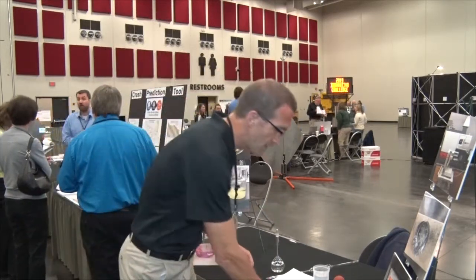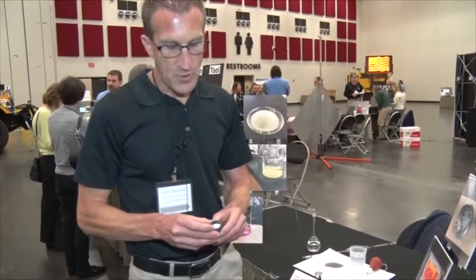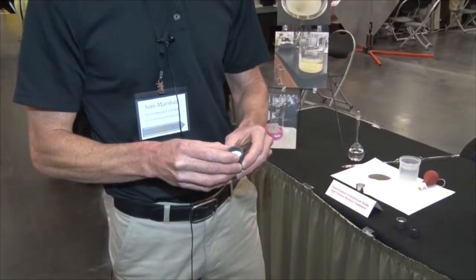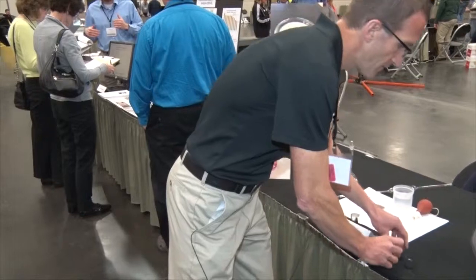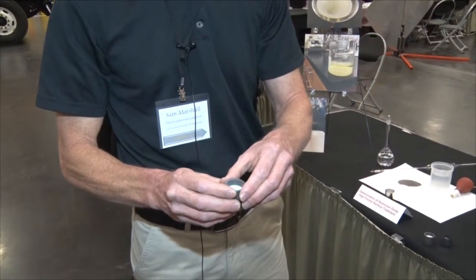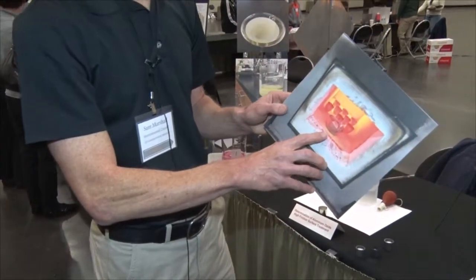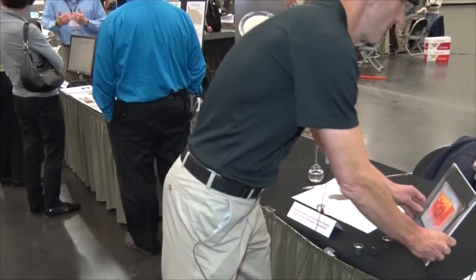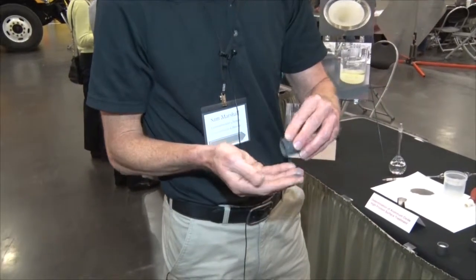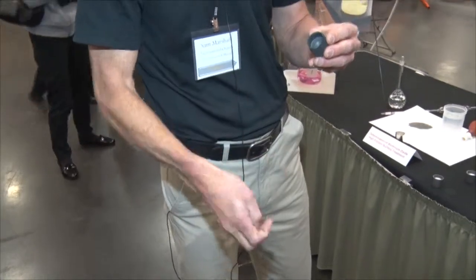One thing I do is you take a known weight of the sample and you put it in what's called lithium metaborate, which is a fusing agent. What that'll do is encapsulate the sample, and then I'll fuse the sample in a 1,000 degrees C muffle furnace. It'll fuse, and it'll become a fused bead like this. But usually it's a little more hot.